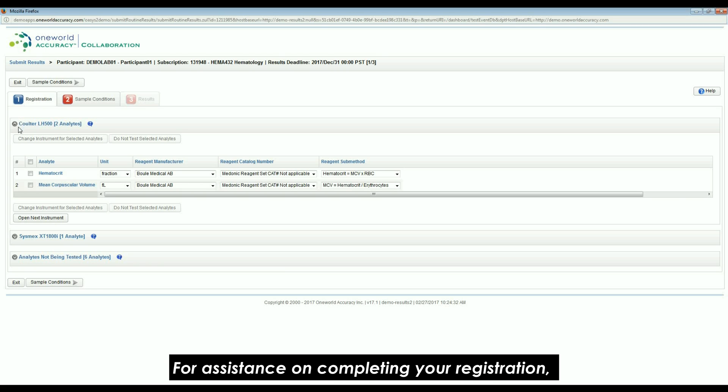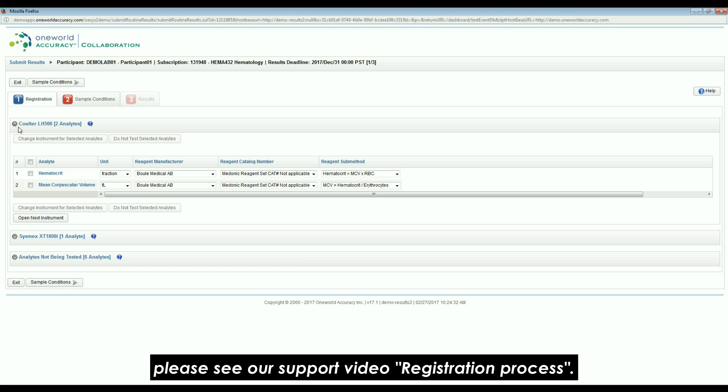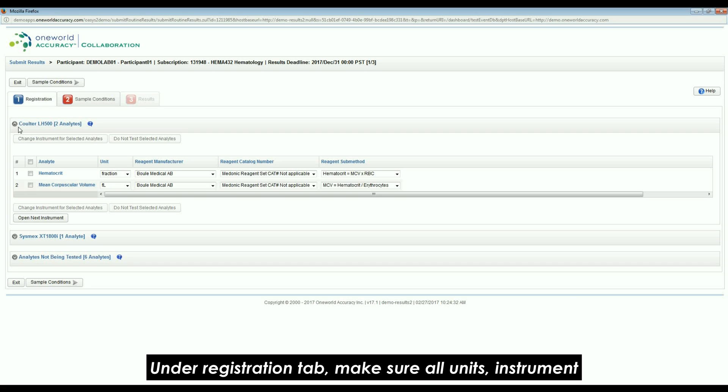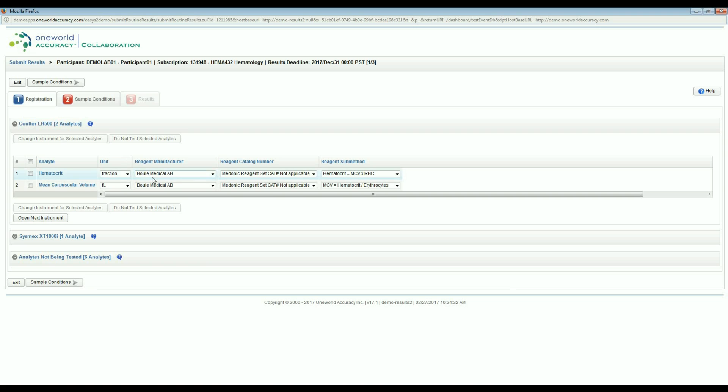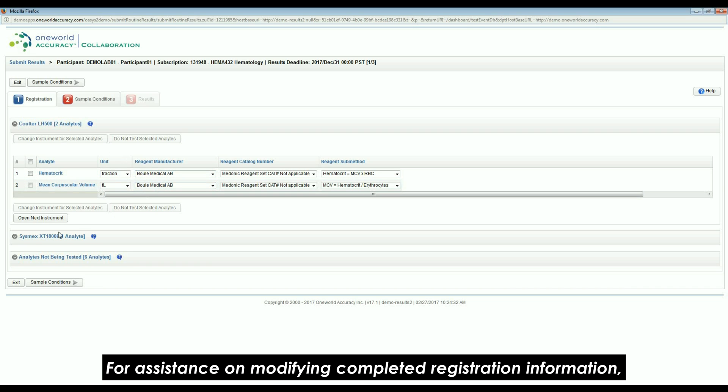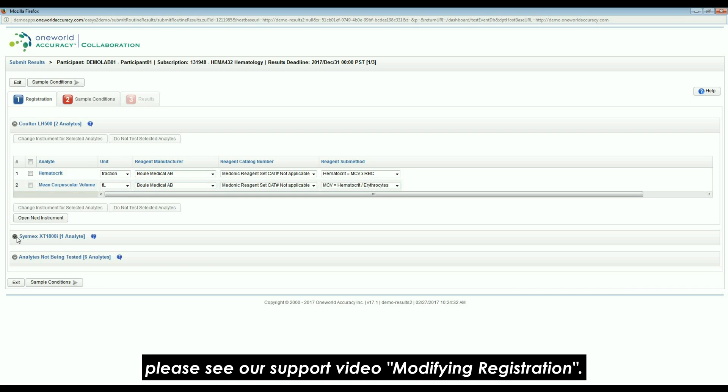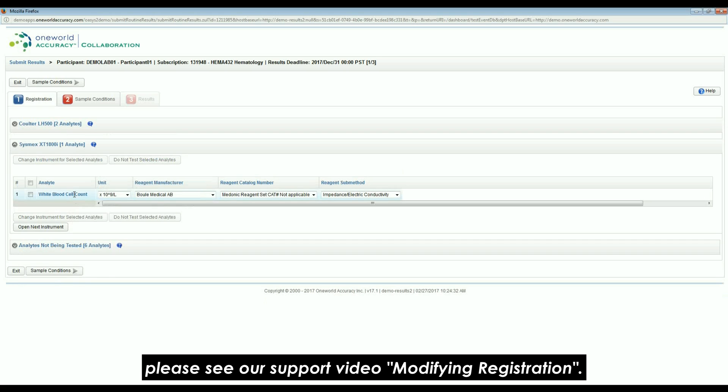For assistance in completing your registration, please see our support video, Registration Process. Under the Registration tab, make sure all units, instrument and reagent information is correct. For assistance in modifying completed registration information, please see our support video, Modifying Registration.